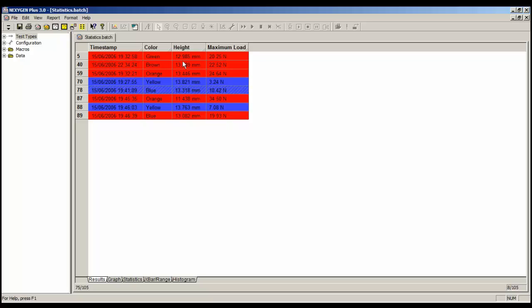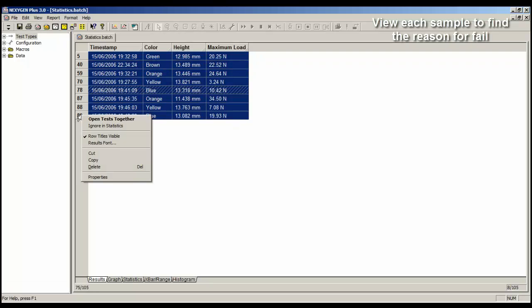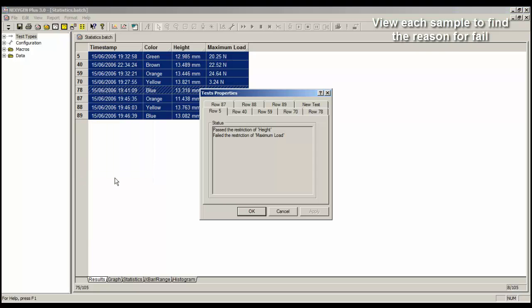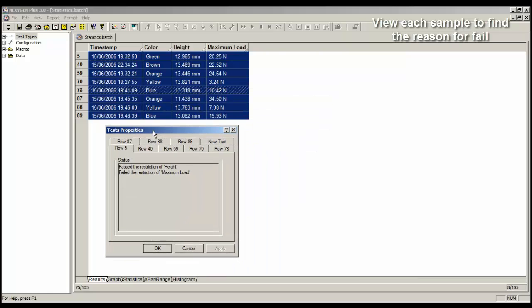There's nothing there to show why each row failed, but there is another feature. Select the first one, hold the shift key down, right mouse click on the last one, and in the menu, we will select Properties. We now have a dialog, which has a tab, for each of these rows.